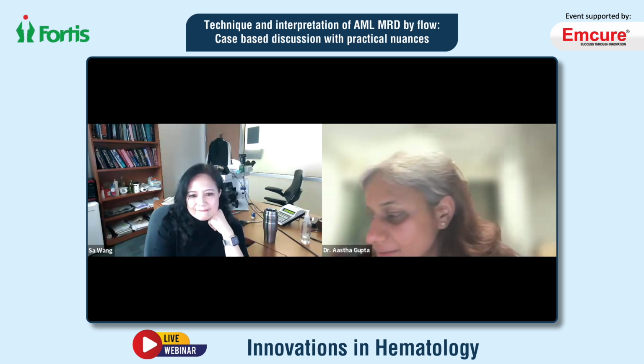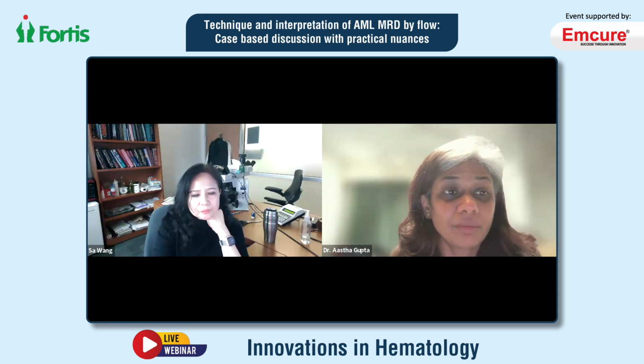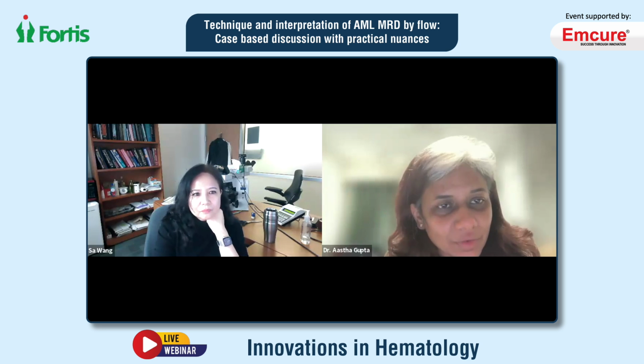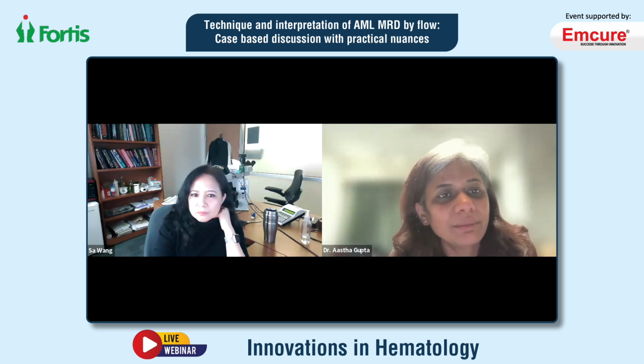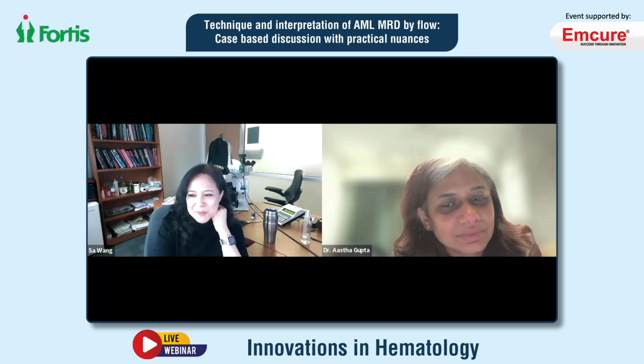Okay, and what are the common mimickers of abnormal myeloblasts? When we increase the number of events acquired in AML MRD, do we get any mimickers that can mimic abnormal myeloid blasts? Oh yeah, these can all be mimickers.